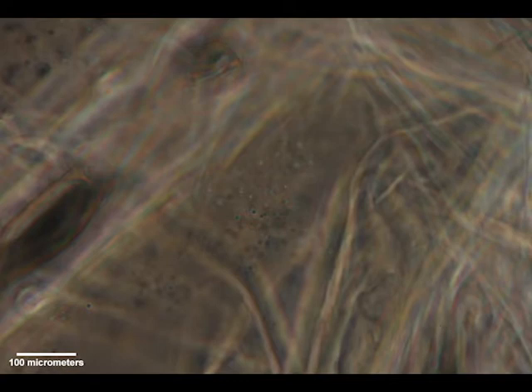If you look at the screen right now, it's a standstill image of cytoplasmic streaming. You can see those little dots are substances, and towards the end of this video, I'll point it out again, when it'll show the actual movement of these particles. But essentially, these particles will just move through the fluid, which is also known as the cytoplasm, in order to get the substances it needs in and out.